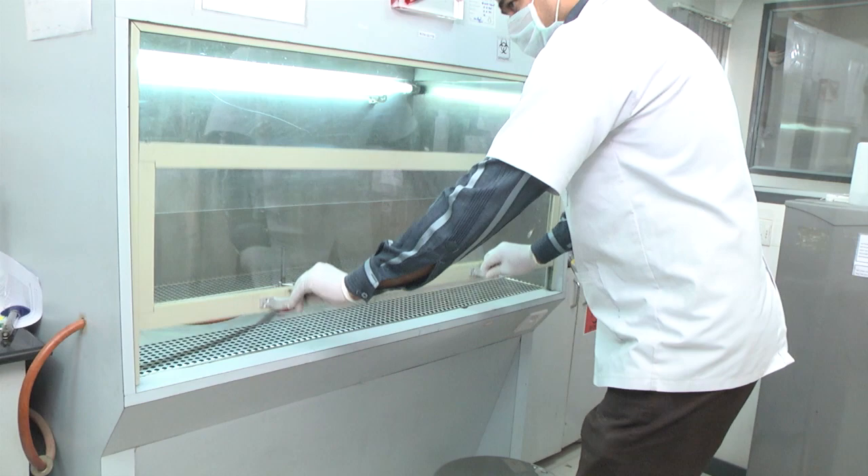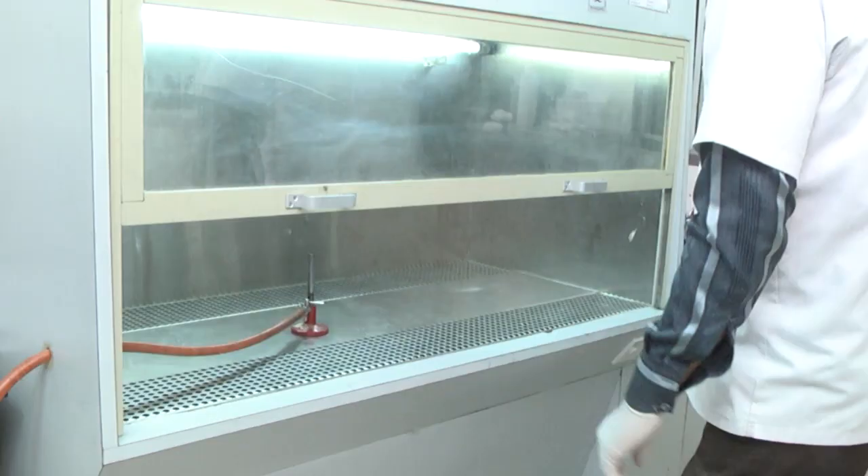It has a front glass window of adjustable height, a ventilation system with an electric motor, a ventilator, and a set of ducts which, while functioning, generate a negative pressure condition inside the cabinet. This forces air to flow from inside the cabinet through the front opening to generate a curtain of air protecting the operator.